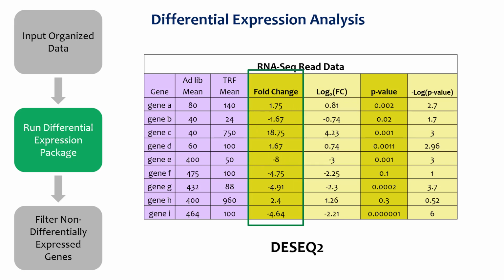For example, gene D gene expression levels are 60 and 100 for samples 1 and 2, respectively. This means that there is nearly a twofold difference in the level of expression between the two conditions. A negative fold change signifies a reduction in gene expression in sample 2 versus sample 1. The p-value reports the probability that this difference in gene expression is the result of random chance. The log of these numbers is calculated to better visualize the difference in gene expression.